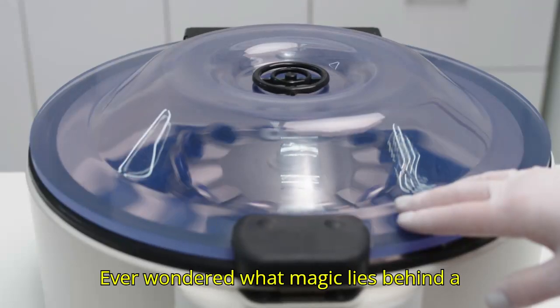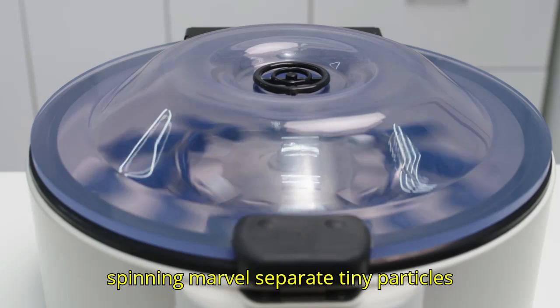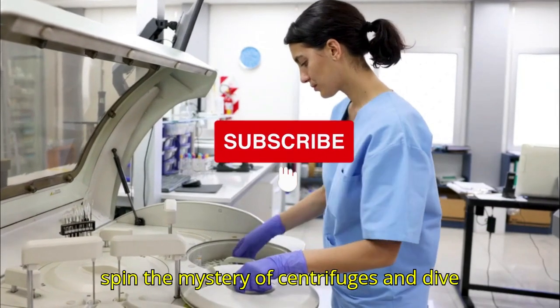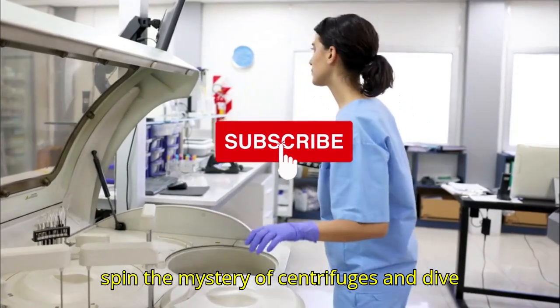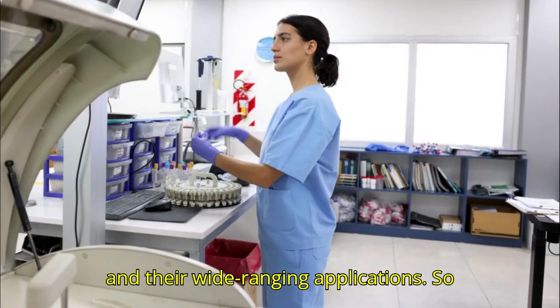Ever wondered what magic lies behind a centrifuge in a laboratory? How does this spinning marvel separate tiny particles in a flash? Well, today we're about to spin the mystery of centrifuges and dive into their principles, types of rotors, and their wide-ranging applications. So let's get started.